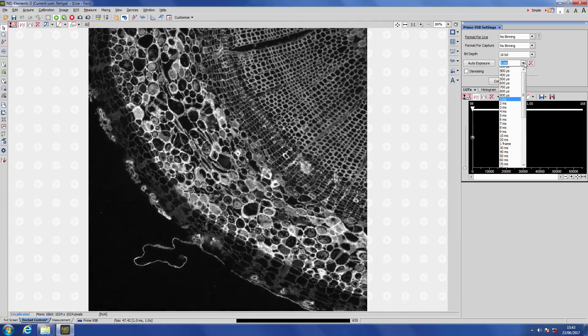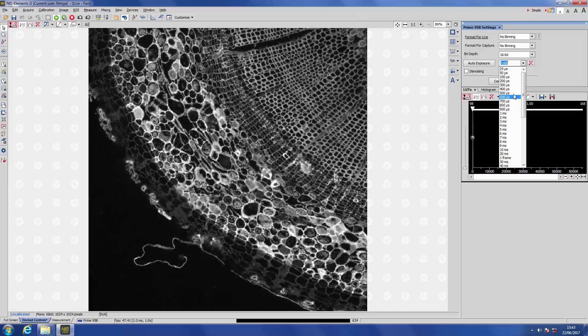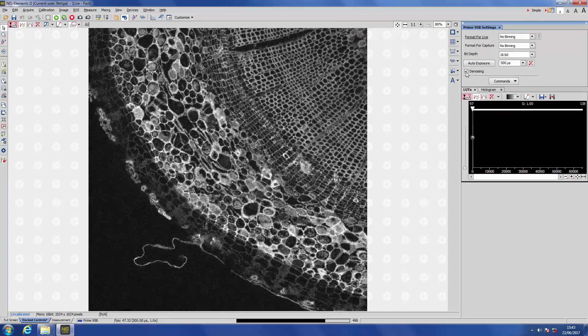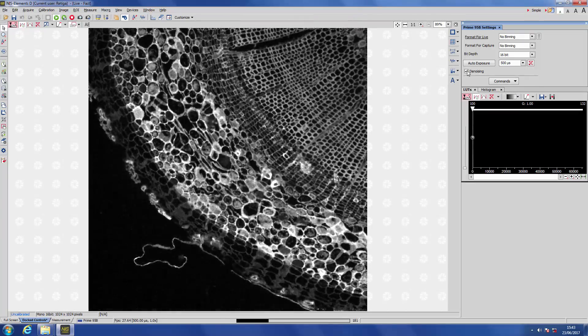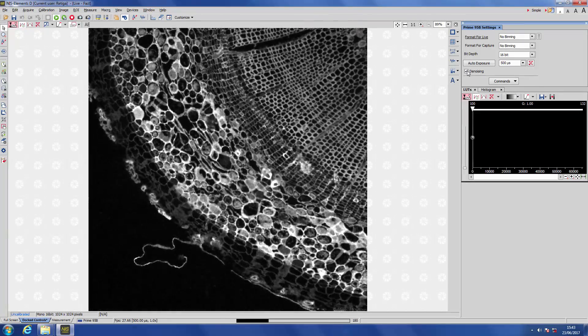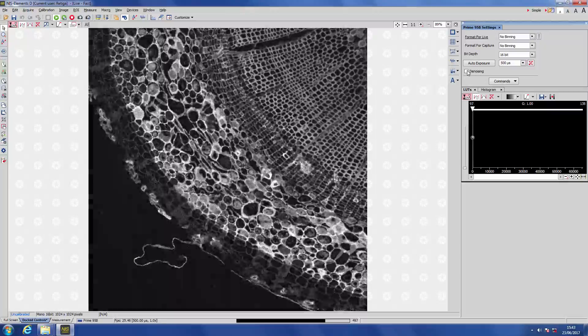If we go to an even lower-light situation, the difference is even stronger. If I turn denoising on and off, you can see the difference that this makes.